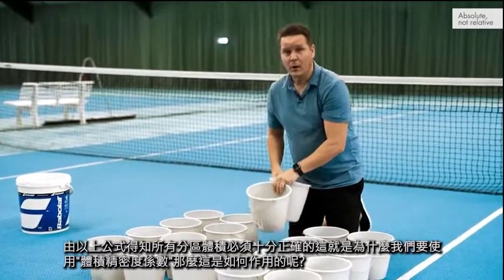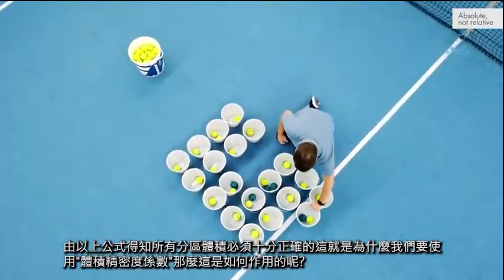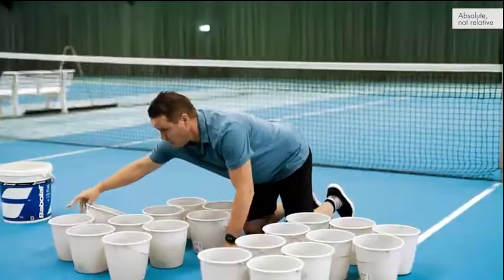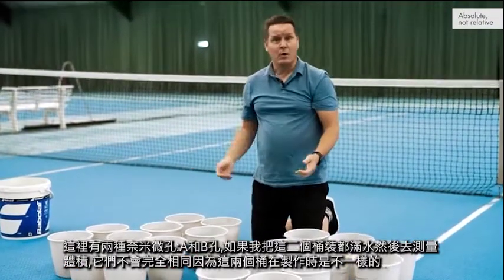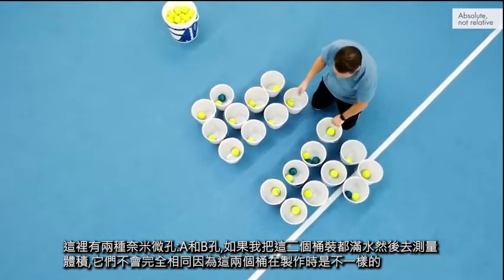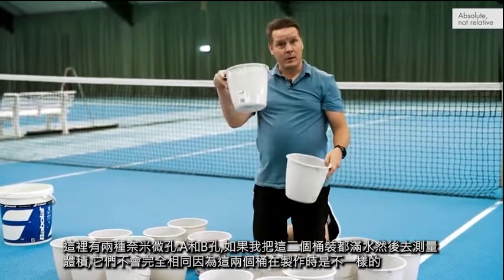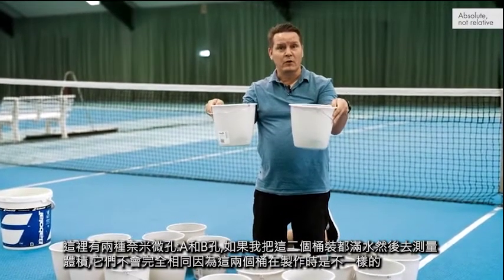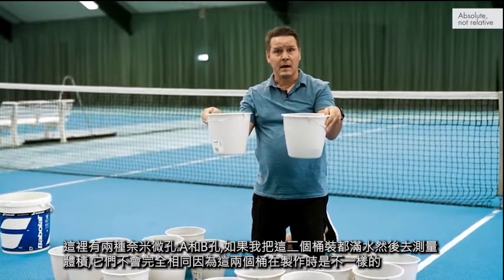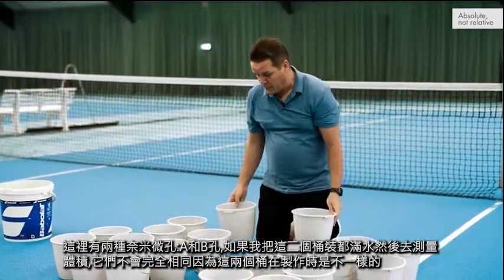So that is why we are implementing the volume precision factor. So how does that work? Well, here you have 2 nanowells, well A and B. As you know, if I fill this bucket with water and I fill this one with water, and then we measure the volume, it will not be the same because they are made differently and not perfect. The same conditions are in our nanowells, and this is what we are aware of.